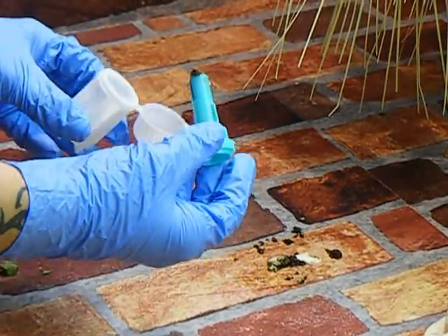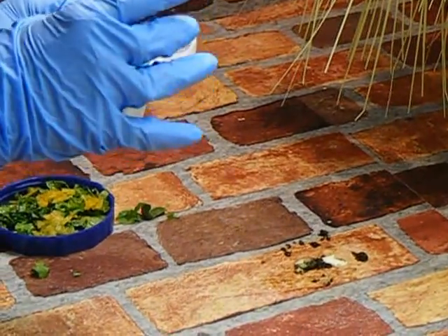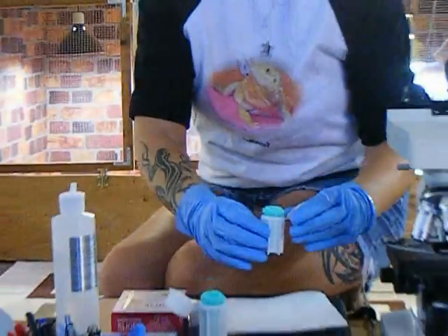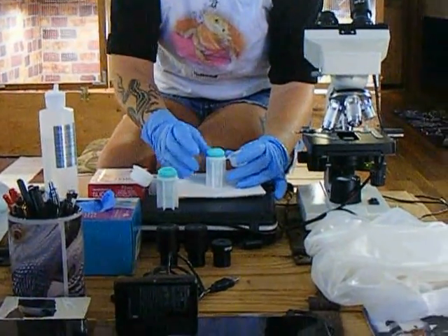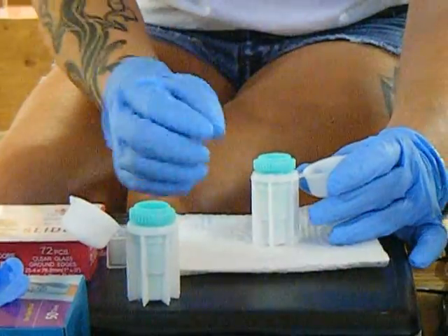Then you place the green part back in your fecal tester, but don't push it tight down — just sit it there lightly. You should always put a piece of paper towel underneath your fecal tester to stop any liquid from running over onto your table or wherever you decide to do it.